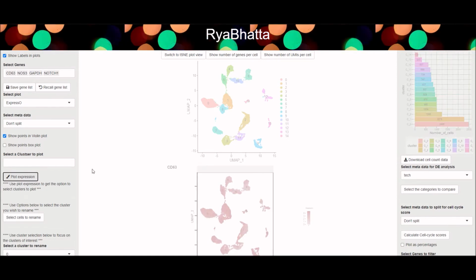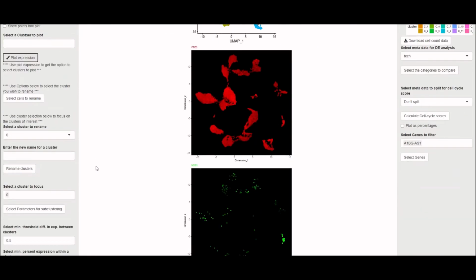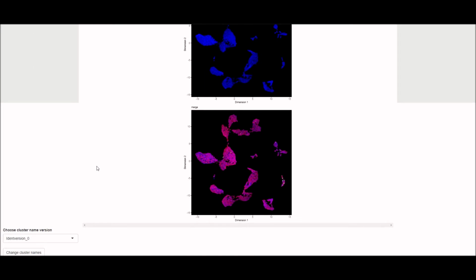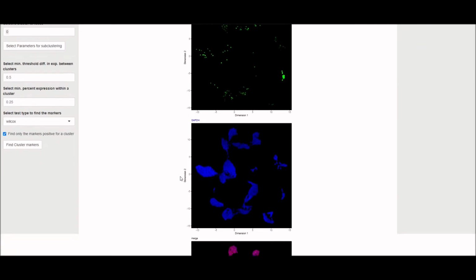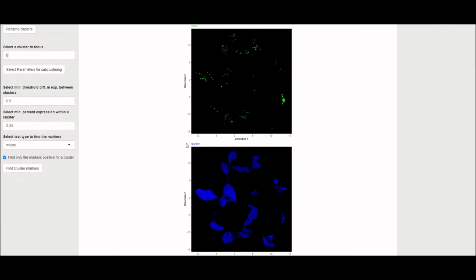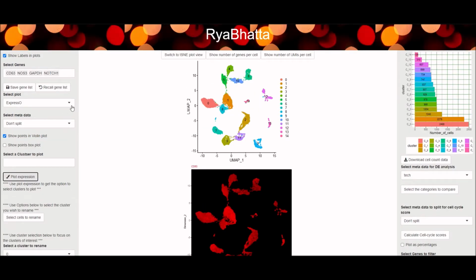An expresso plot, short for an expression orientation plot, allows you to compare the expression of different genes. It overlays their individual expression into a merged plot. Up to 3 individual genes can be compared using this approach. The expression of each of the genes can be oriented with respect to the other 2 genes. This will be handy when you want to compare transcription factors and their target expression.